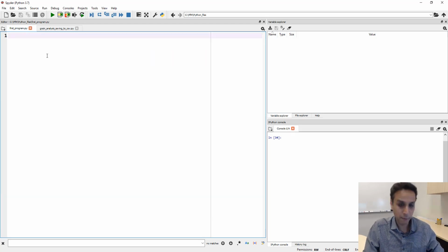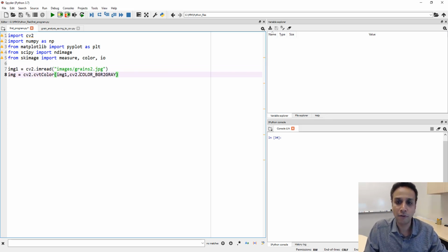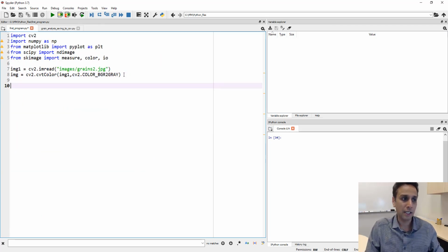So let's import all the libraries from the last time. We probably need them. And let's import an image, and this time I'm going to import it using an example I've used 2-3 tutorials ago, which is using OpenCV to convert an image from BGR to gray. Nothing wrong in importing the image and then putting 0 in there, so we import it as a gray level image. This is a different way of doing things, so why not repeat it?